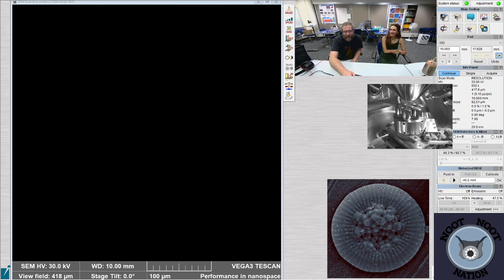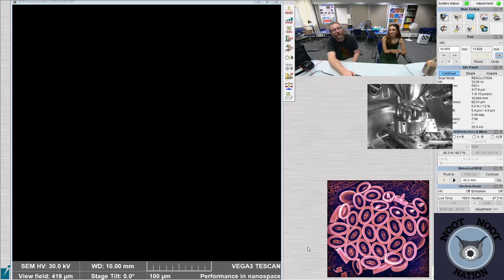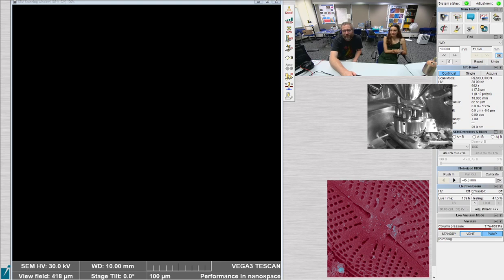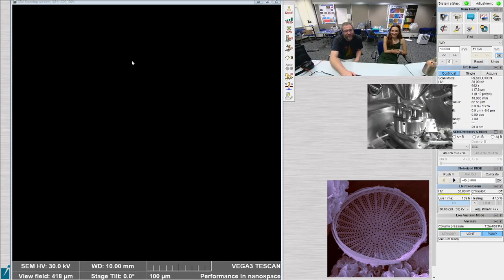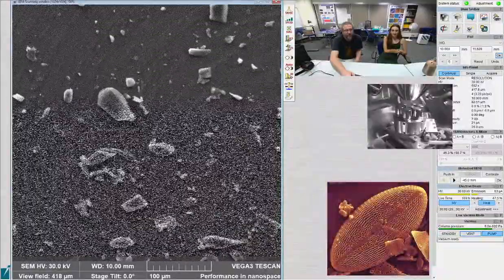See how hard it's fighting to try to get it? Yeah, it's struggling. We might have to vent it and pump it again. It's still going down. I feel like it's going to turn green any moment now. It'll get there. They can't actually see the bar because I have this color thing in front of it. Get rid of that. There, you can see the bar. A little vacuum that could. Ooh, mine! I told you so. Yeah, I had no faith. Well, hopefully now I will engender faith when I say I think it's going to work.